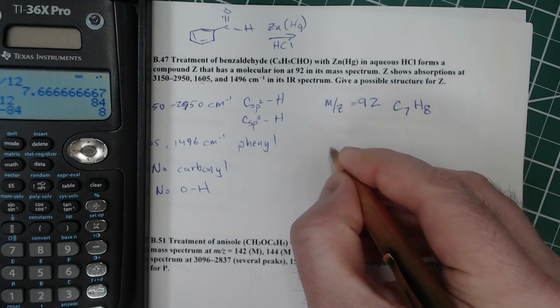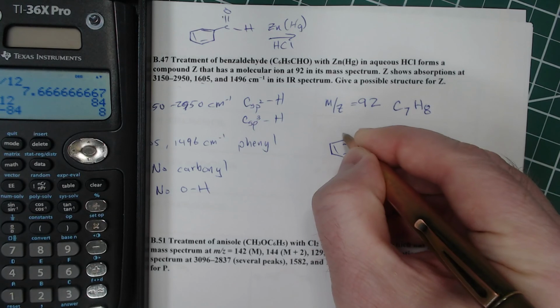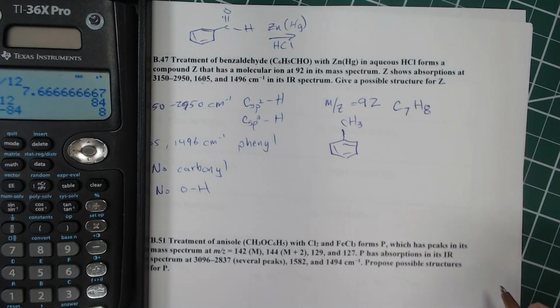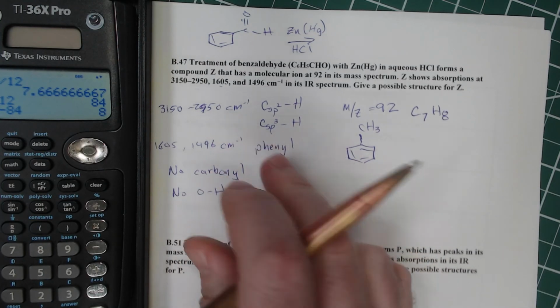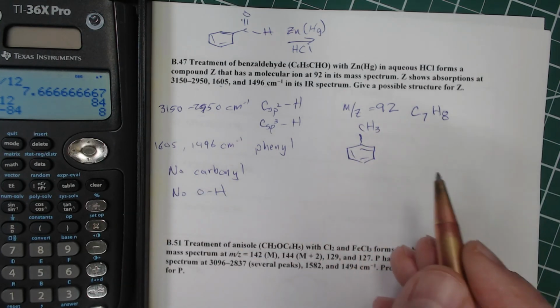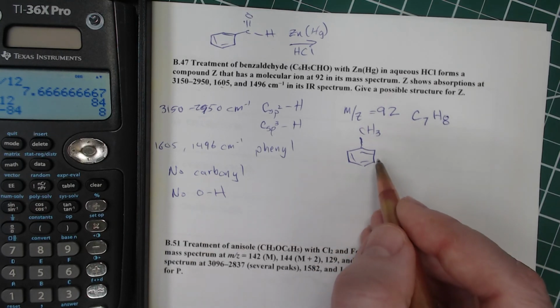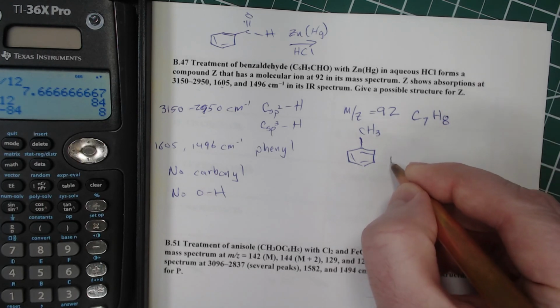So we simply reduced it. All right, and if we look at that, it's got the carbon-hydrogen sp2, it's got carbon-hydrogen sp3, it's got the benzene ring, so it's got the phenyl group, and there's no carbonyl and no OH. So this is consistent with our structure. And so this is our probable structure.